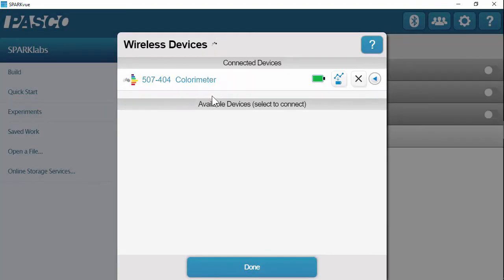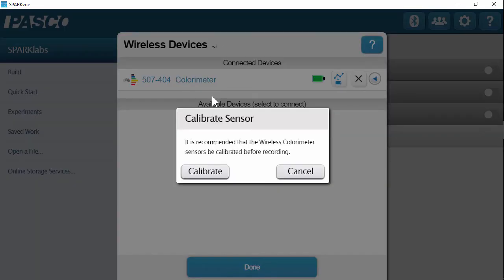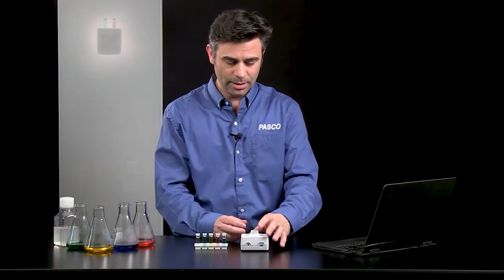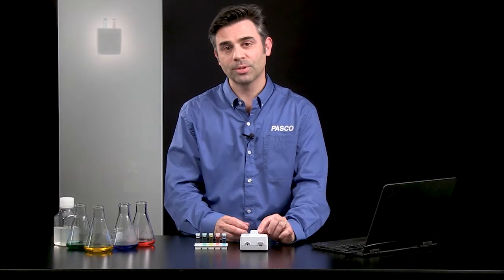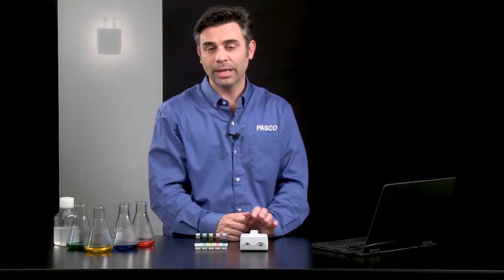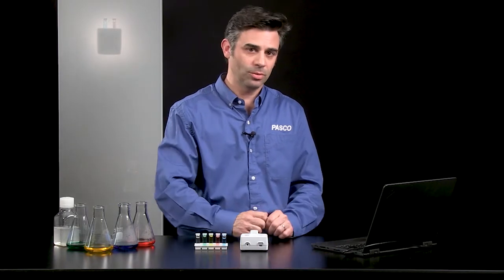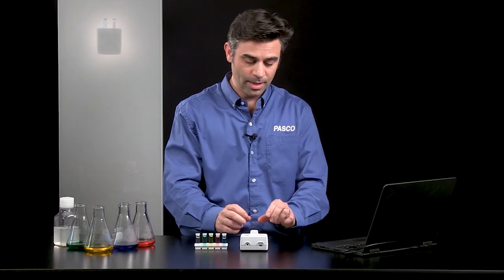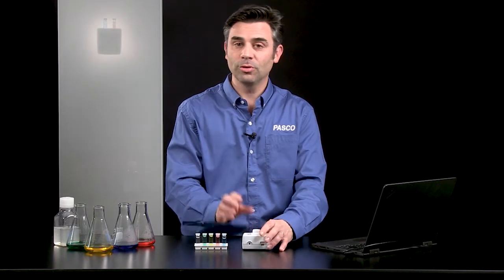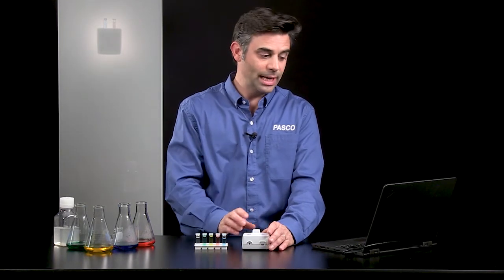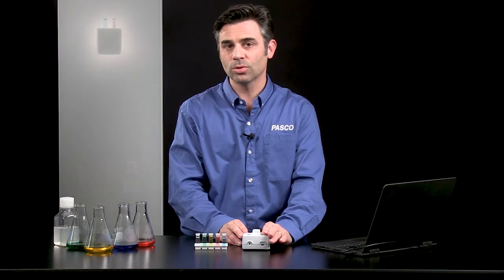After it connects, you'll notice that a prompt appears to calibrate the sensor. Calibration is an important part for colorimetry and turbidity. So it is recommended that you calibrate each time, and it is recommended that you instruct students to do so. If you are in a hurry or if you know you calibrated very recently, you can hit cancel because the calibration is stored right on the device. But I'm going to walk through the calibration.